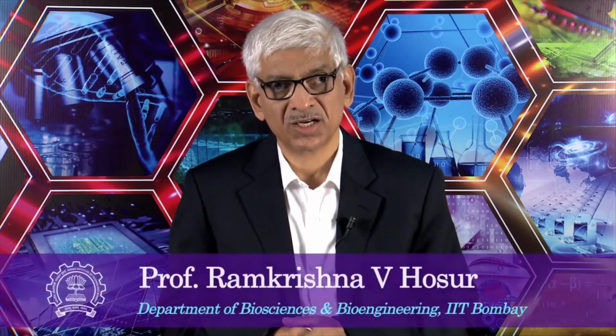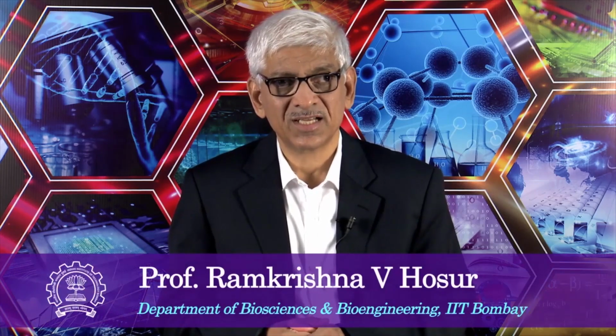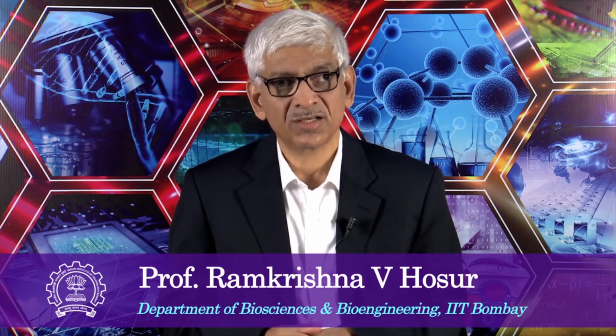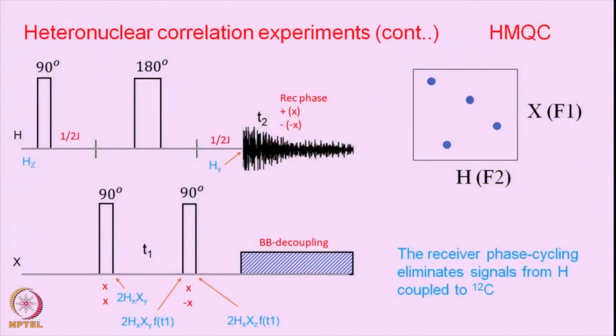So, we have been discussing heteronuclear correlation experiments, two-dimensional experiments. We discussed last time various options and various ways of recording heteronuclear correlations. So, we will continue with that now, some more options which are present here. One of them which I will now discuss is so-called heteronuclear multiple quantum coherence spectroscopy, abbreviated as HMQC.